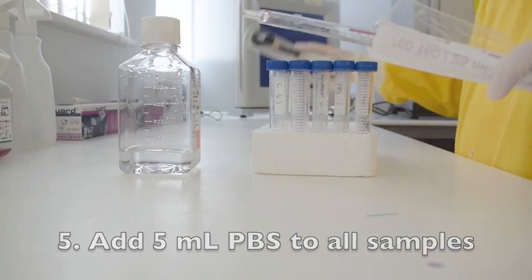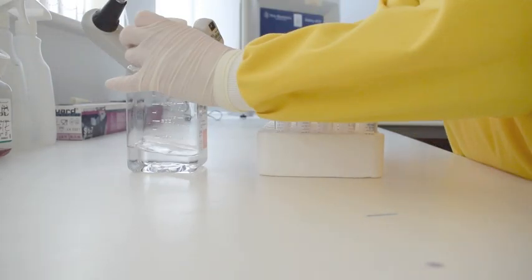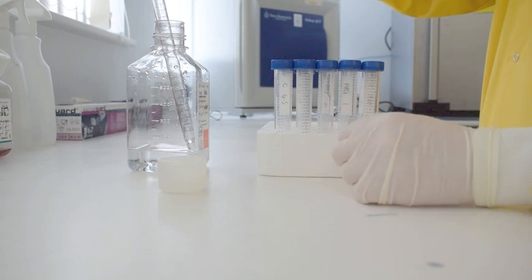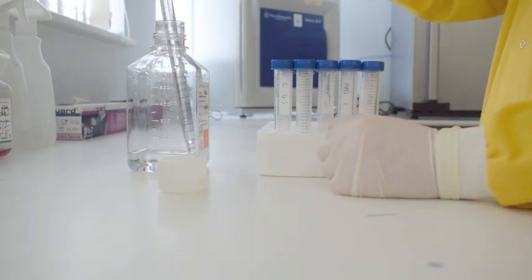5 milliliters of PBS or phosphate buffered saline is added to each cell culture. This allows washing of the cell cultures and removal of any excess medium.